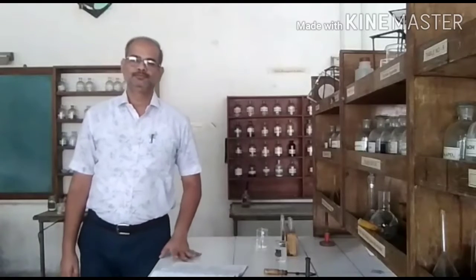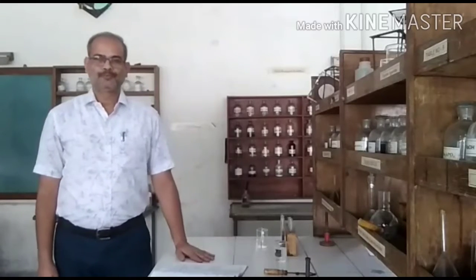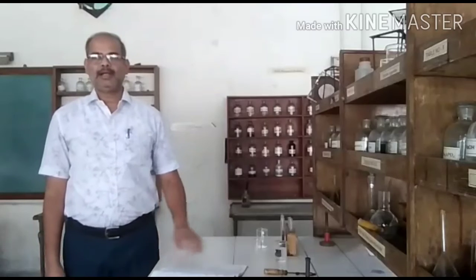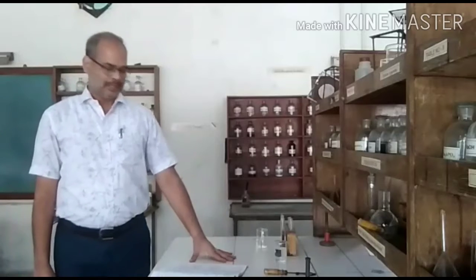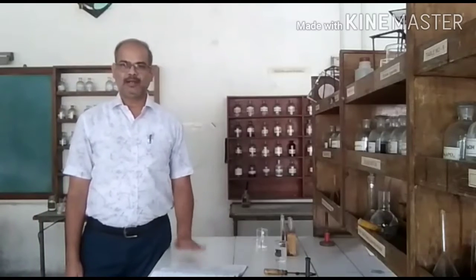Hello students, through this video I am explaining and demonstrating a very simple experiment included in the syllabus of your practicals, that is inorganic qualitative analysis of acidic radicals. This is the third video on this practical.